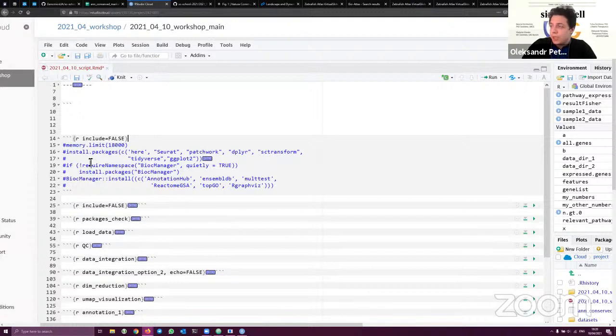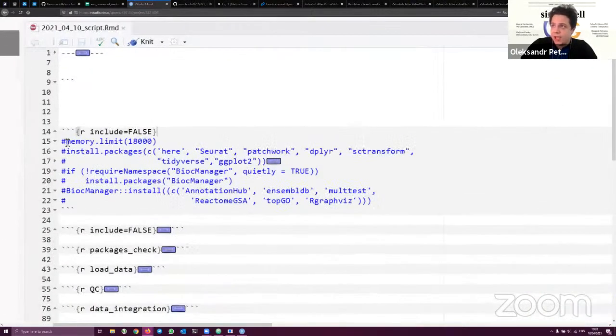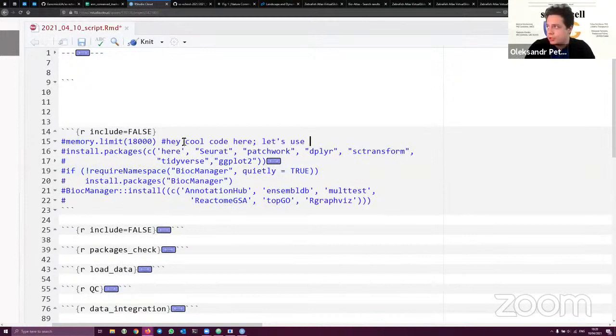So let's go to the first one and begin. Just in case, if you work in RStudio, you can actually start by opening the file which I provided on GitHub, and just copy paste the very first block, which starts with a hashtag. You see this hashtag. Hashtag means that something is commented out, meaning that if you put the cursor here and press Control Enter, nothing happens, because for the program it's just a comment. But as soon as you delete this hashtag, you can use it.